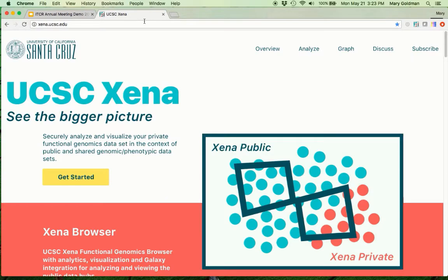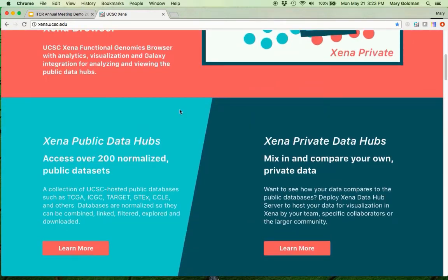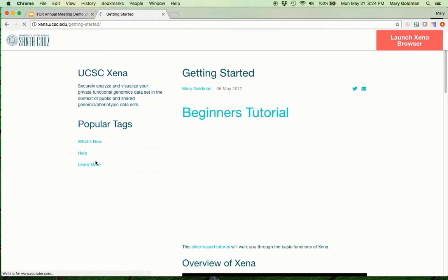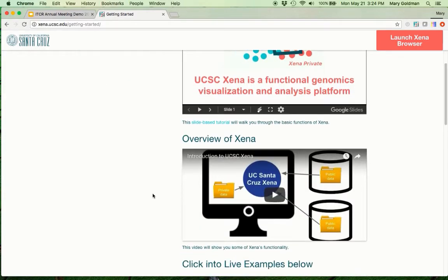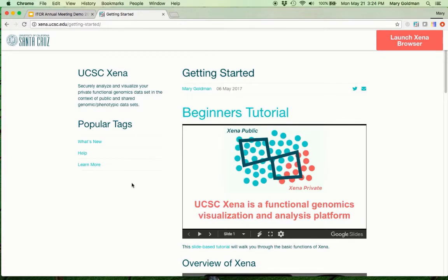I'm going to start our demo by going to our homepage. You can scroll to learn a little bit more about Xena. I'm going to click on the Get Started link here. So when you get here, you'll see our beginner's tutorial. And I'm going to cover a lot of what is in that tutorial, but there's still some things in there that might be useful for you. Scrolling down, you can see a number of live examples that you can click into. And now I'm going to launch the browser.